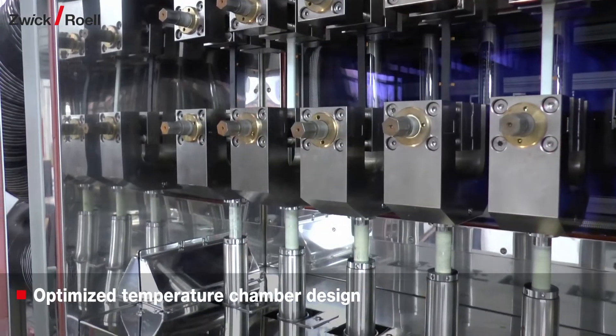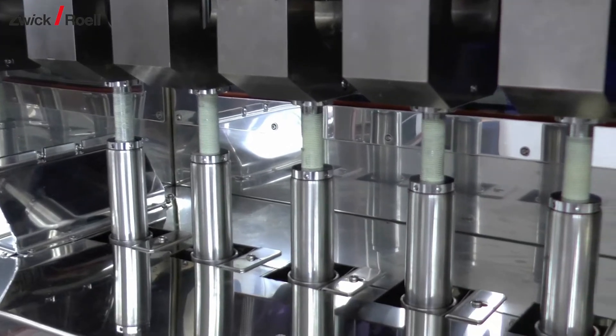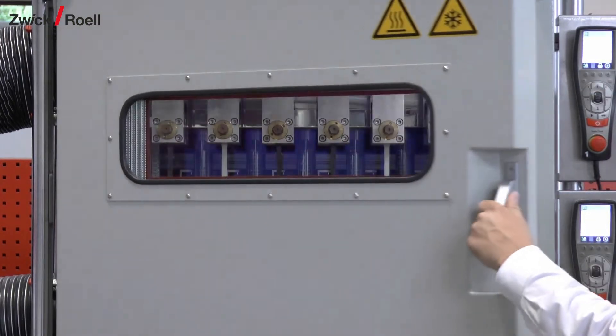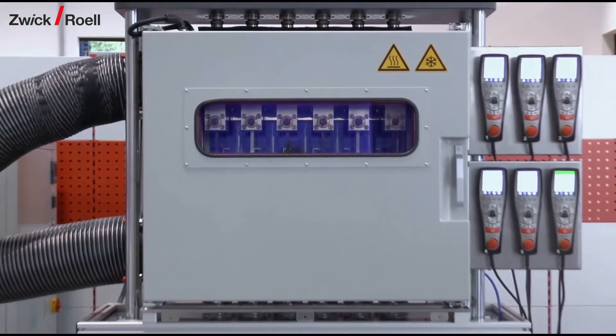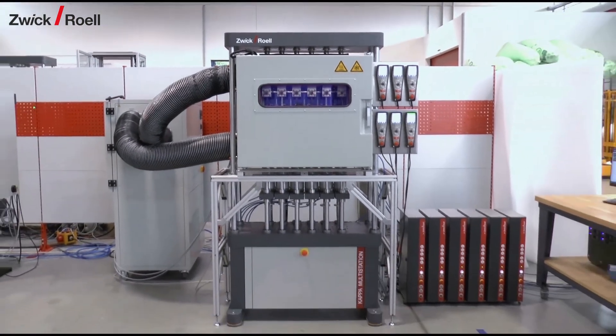For optimal temperature distribution along the individual stations, the supply air is distributed to the stations in the lower part of the chamber. The desired temperature and humidity are generated in an extended conditioning unit located right next to the test frame and connected directly to the chamber using supply and exhaust air hoses.